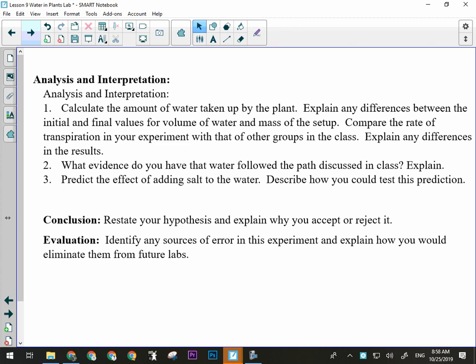Okay, please. When measuring starting volume, are you just kind of like, because you said the measurement at a certain point, and you want us to go past that? Yeah. Sort of kind of like eyeballing it? Yes, you're eyeballing it. Don't take it all the way to the top. Estimate enough room to put the leaf in without making it overflow. Okay? And not so little that it'll get out of the water.